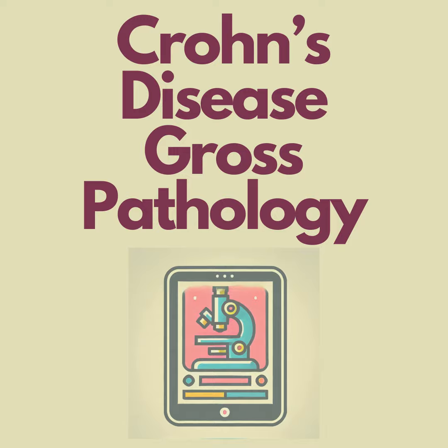We do. So what happens to this specimen once we're done describing it and taking our samples? It goes to the histology lab where it's processed and embedded in paraffin wax. And then it's cut into very thin sections that are placed on glass slides. And then those slides are stained with special dyes that allow us to see the cells and tissues under the microscope. So that's where the real detective work begins.